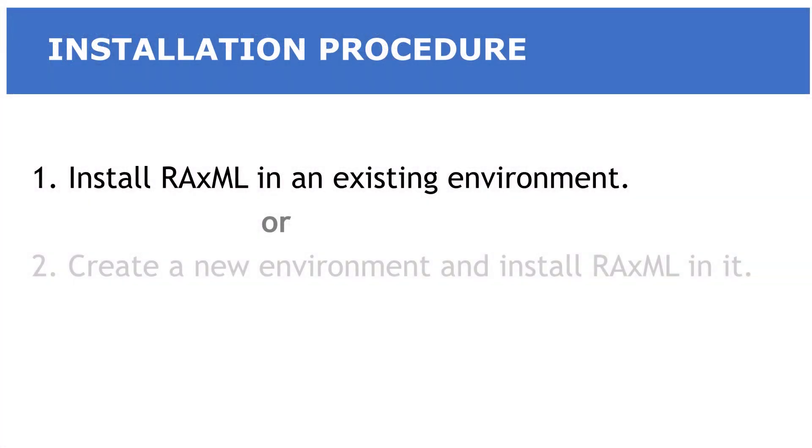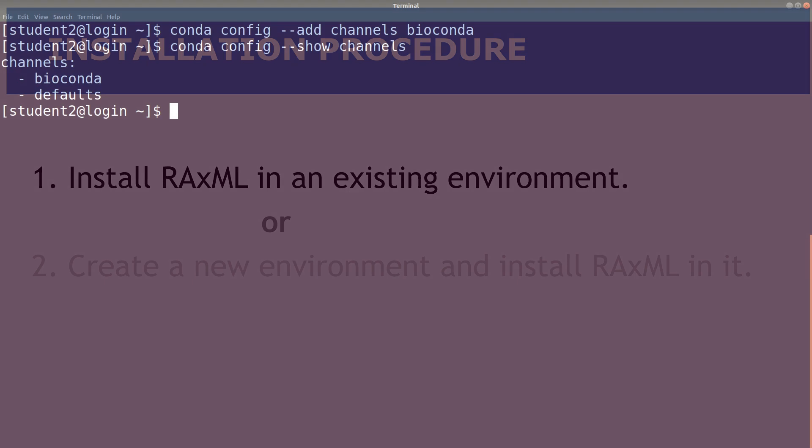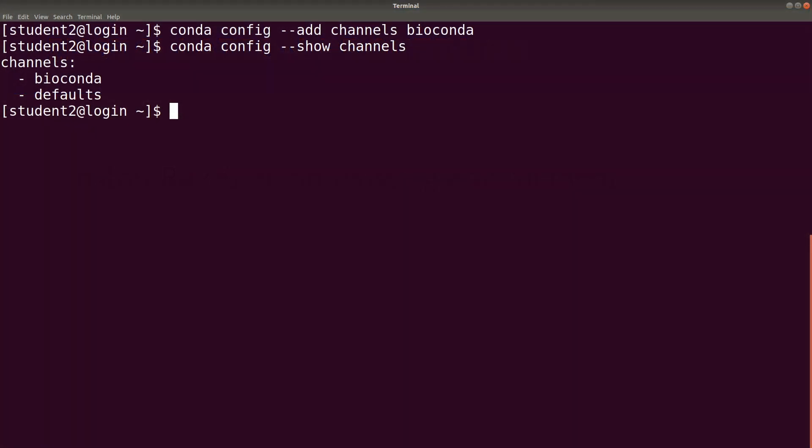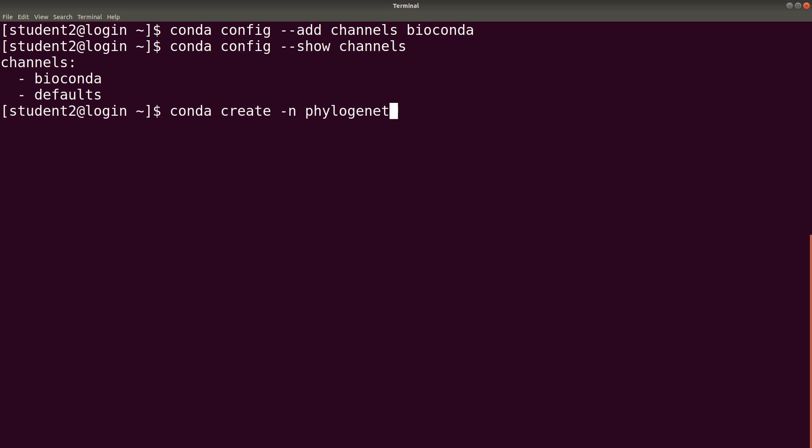We will now begin with the first approach, where we install RAxML in an existing environment. We will therefore create that environment and install RAxML in it. So, we create the environment. We say conda create -n and we indicate the environment name. In this case, phylogenetics. You can use any name that you find appropriate. We are now executed.